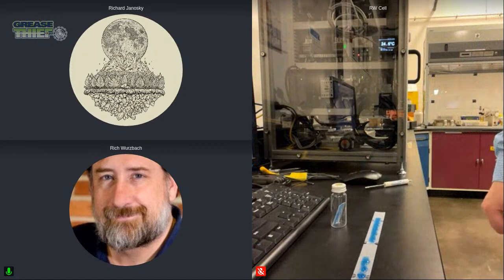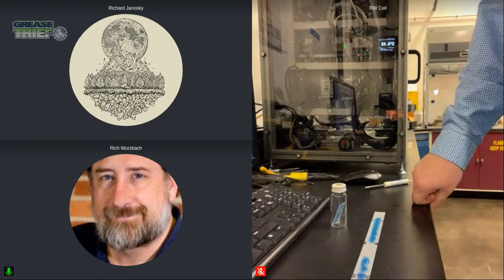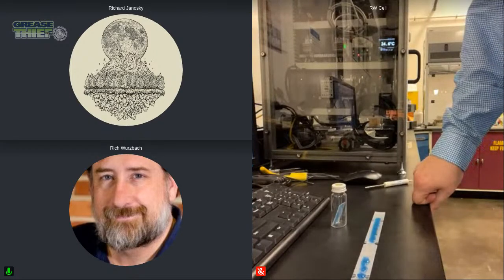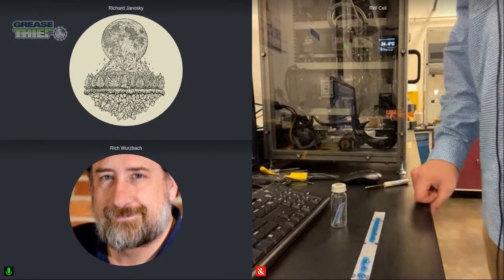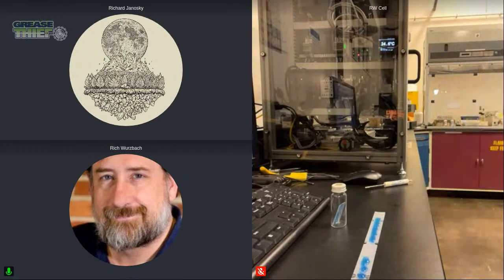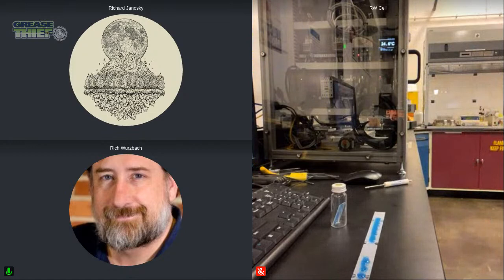And if we just kind of dig out 0.25 grams of grease, and one technician is able to smooth it out better than the one before them, it changes how that solvent acts. Or in the case of what you prepared for us here in this particular vial for doing the moisture, it changes the availability from a surface area perspective for the transfer of moisture for the purpose of counting. And so yes, it saves time and it can save money, but it also creates a more repeatable and reproducible process in terms of the preparation of the grease being in this thin film configuration.